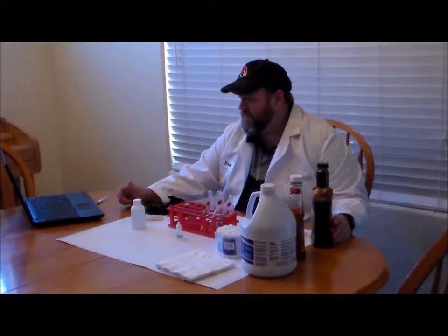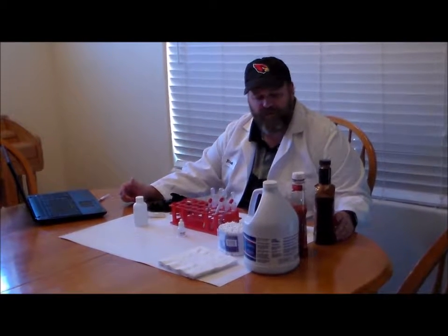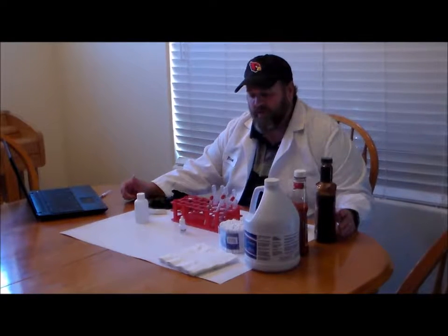All right, folks, we're getting ready to do the blood stain and body fluid identification exercise, and I wanted to record a quick video to show you the supplies that you're going to need to complete this exercise.